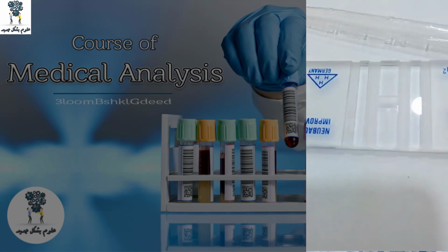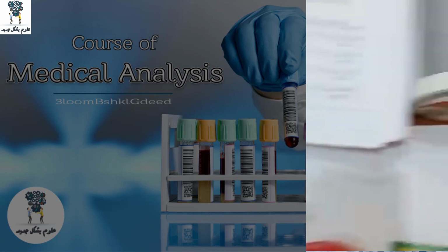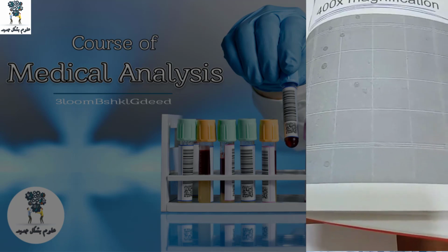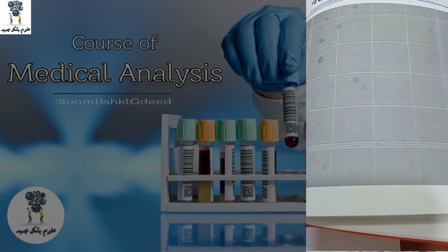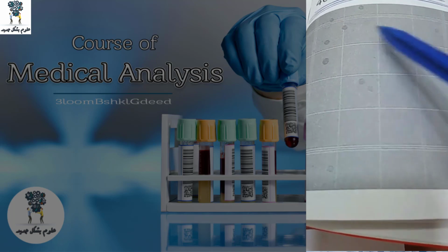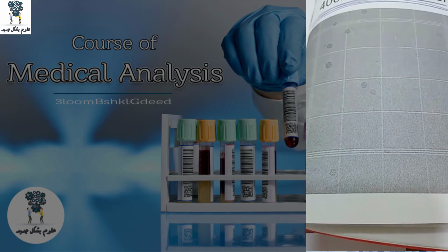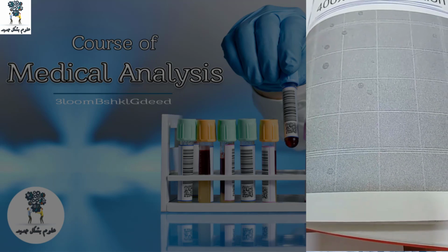What will you see in the slide? We will see this square. It's a large square, and we can find different numbers of sperm according to the case. Here in this case there are no sperm, there are only cells.